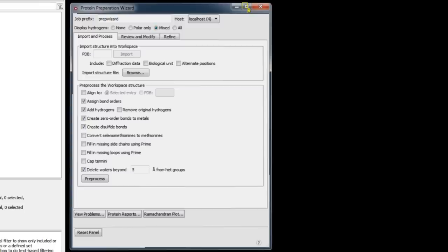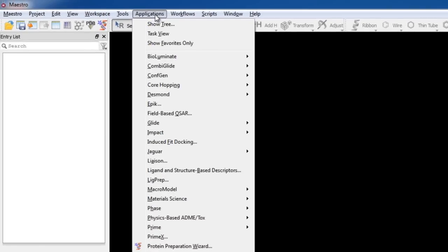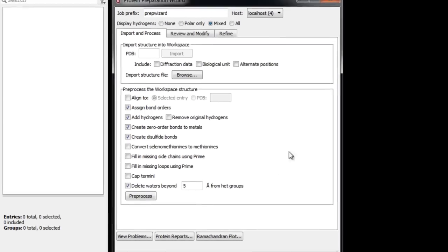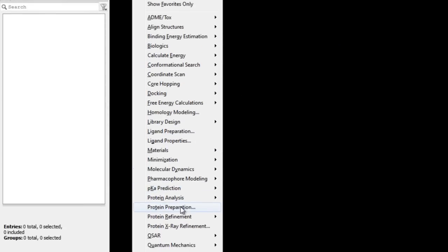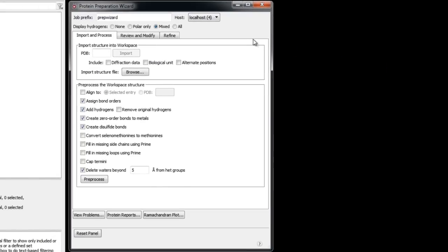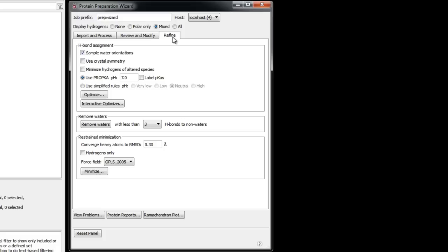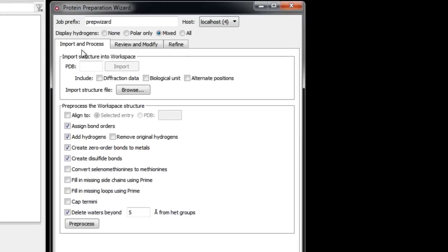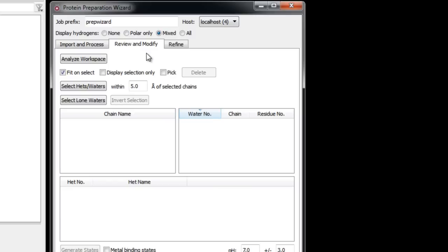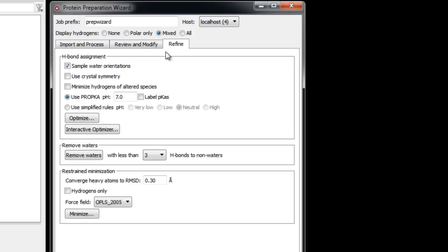To launch the Protein Preparation Wizard, go to Applications > Protein Preparation Wizard, or in task view mode go to Tasks > Protein Preparation, or search for it in the task tree. There are three tabs in the wizard covering all stages of protein preparation. In the Import and Process tab we can import a protein and perform basic tasks for fixing the structure. In the Review and Modify tab we can delete unwanted chains and waters and fix or delete het groups. In the Refine tab we can optimize orientations of hydrogen-bonded groups and minimize the structure.